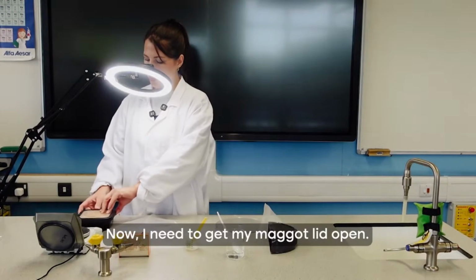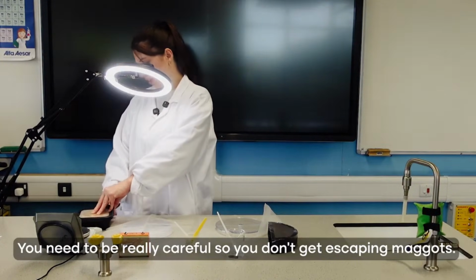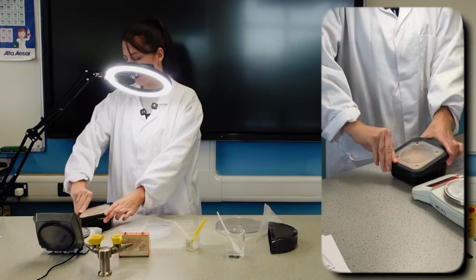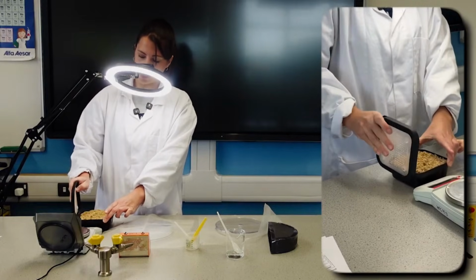So I need to get my maggot lid open, and this is when you then need to be really careful that we don't get escaping maggots. Whilst also considering the ethics of this investigation, we are using a living thing here, so we don't want to be causing any harm to the maggots.